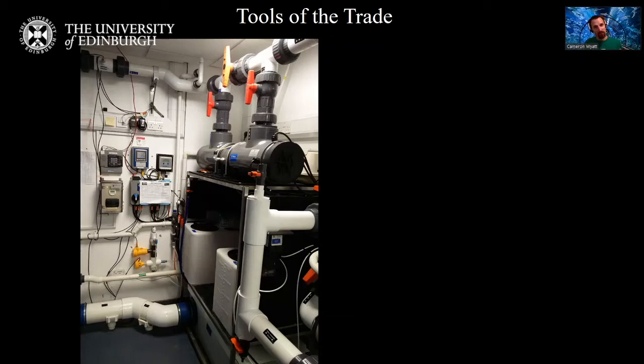So we have this monitoring system on the wall here that constantly has sensors in the water, constantly reading the temperature, the pH, the conductivity, the dissolved gas, various things, and then adjusting that automatically. It doses in from these big buckets here that contain different salt solutions, to keep the system at just the right level. Because the fish like mostly fresh water with just a little bit of salt. They come from India and surrounding countries, and they live in pools and rivers and even rice paddies where the water is mostly fresh, but a little bit of salt is good.